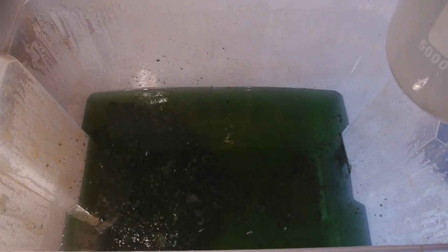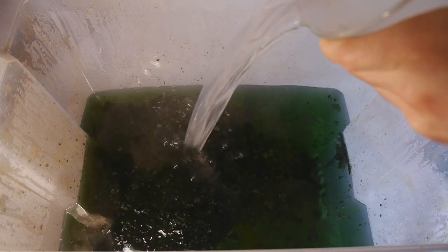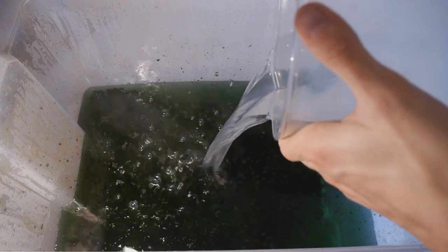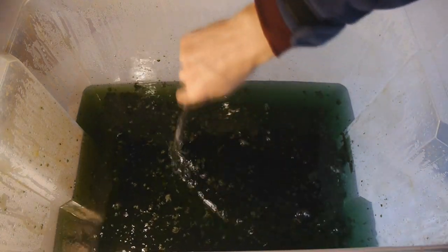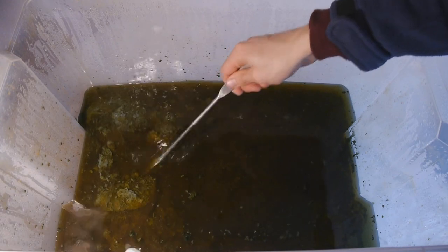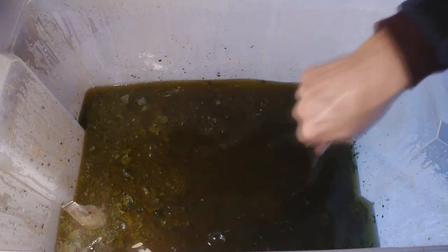Okay, you can see the iron is starting to precipitate. Alright, and now we need to mix this very thoroughly, which is quite difficult with these huge amounts of stuff. This looks so funny. Check this out. This very voluminous iron hydroxide precipitate, that's the color I was after.